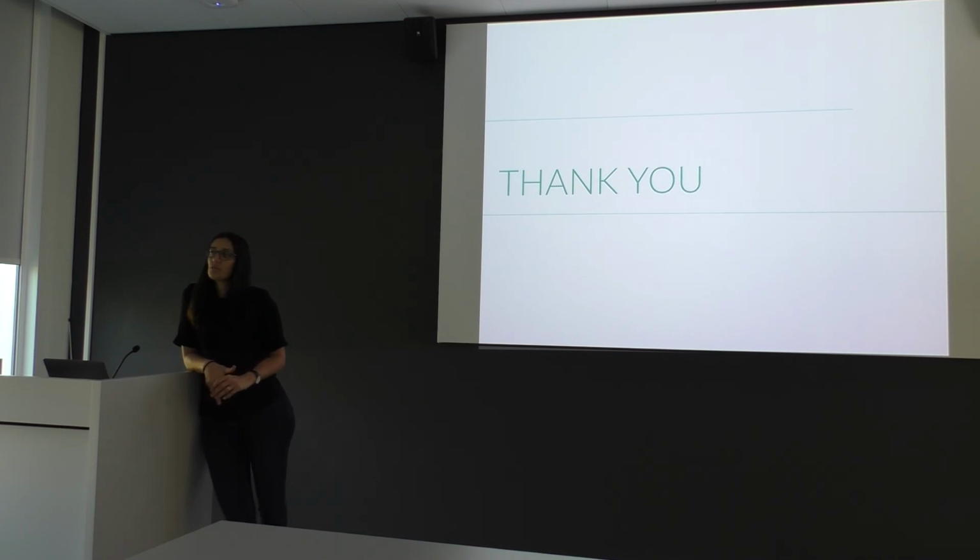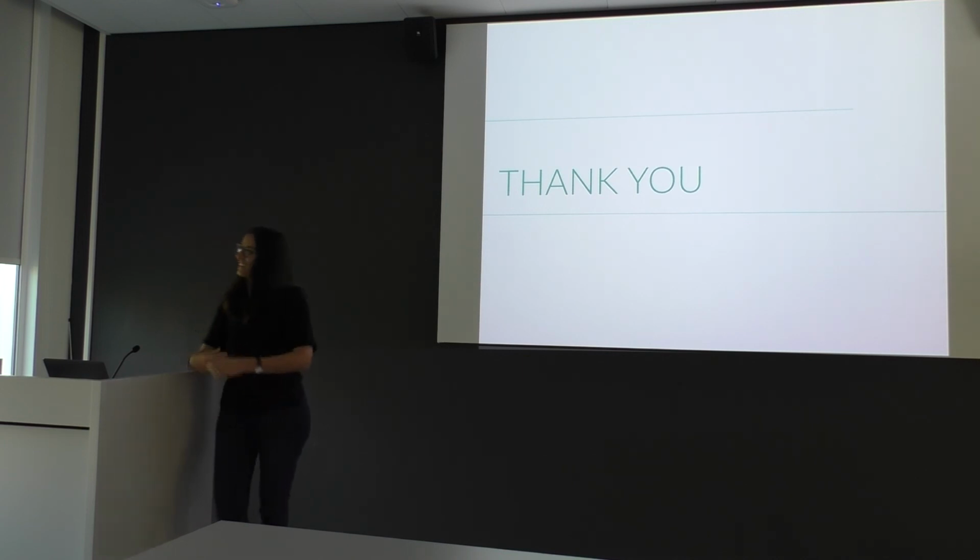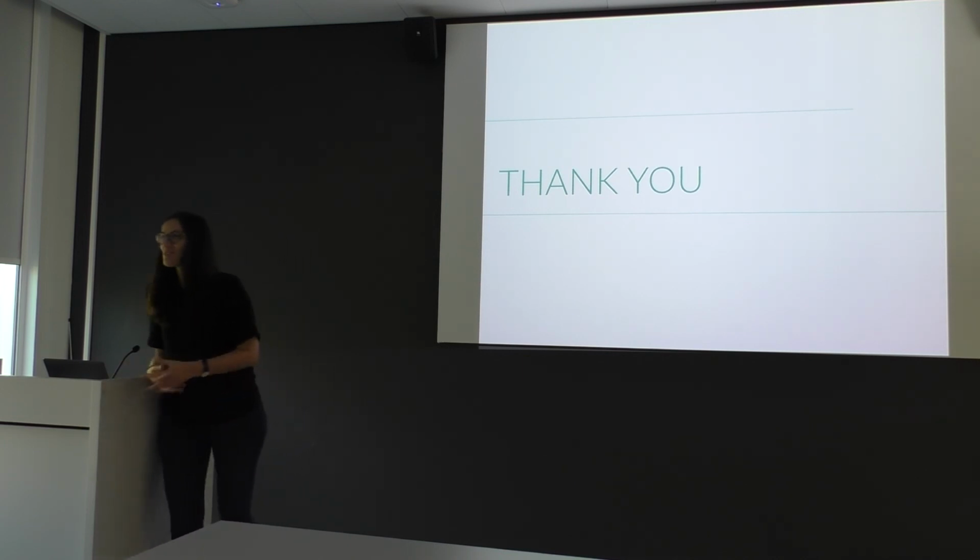It's also the stage. There's a bit more looping of the stage. If you alpha wobble it, it also moves a bit in the direction of the holder, more than a good Krios stage would do. So it turns out the stage is physically different, which you can see from different angles, at large angles.